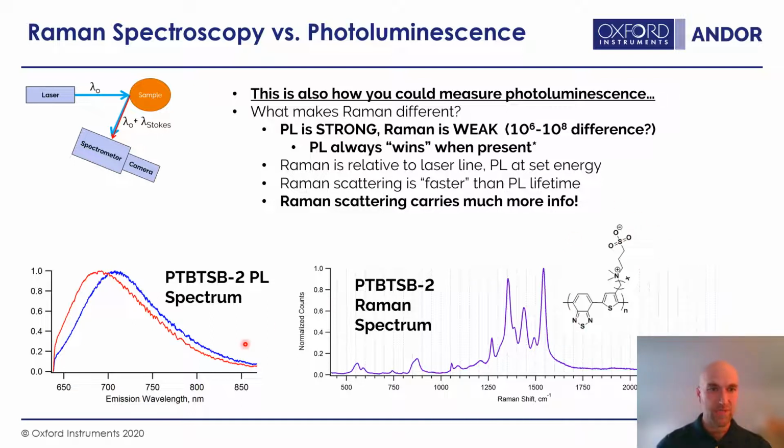Here is its photoluminescence spectrum in blue, and you can see, as with many organic dyes, or organic molecules in general, it's poorly resolved and broad. You can see the x-axis on here goes from 650 to 850, so it covers a large part of the near infrared. And it's blobby. There aren't really very many well-resolved features. So the question is, how much information would I need to characterize the spectrum?